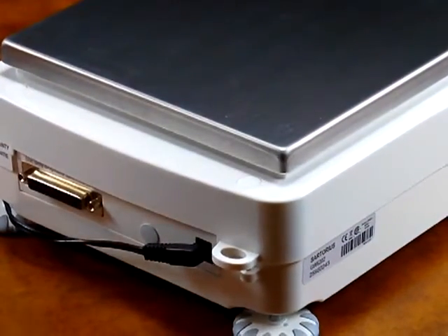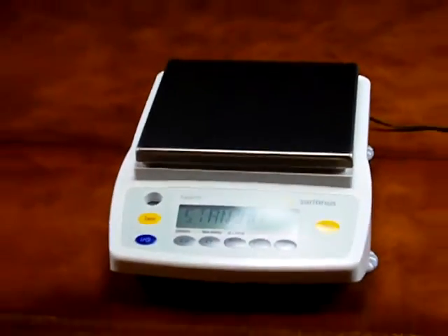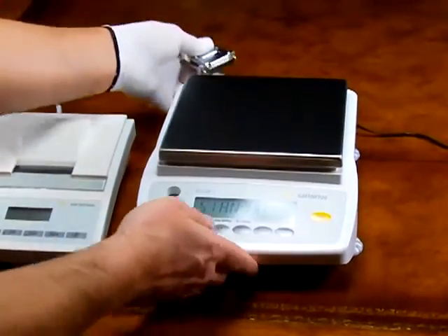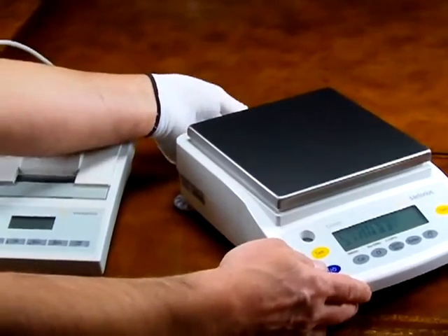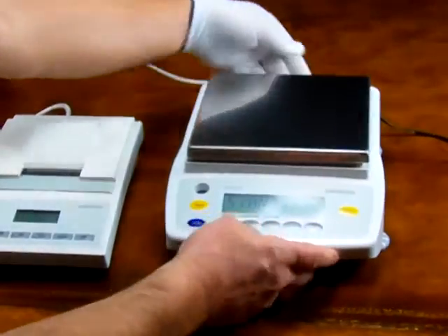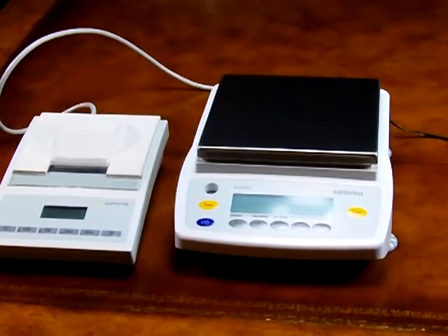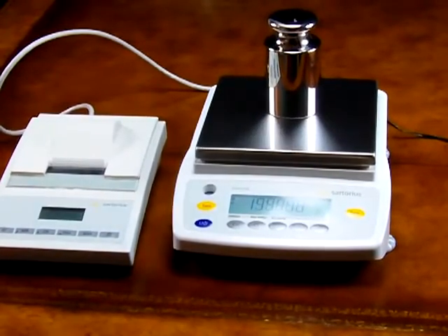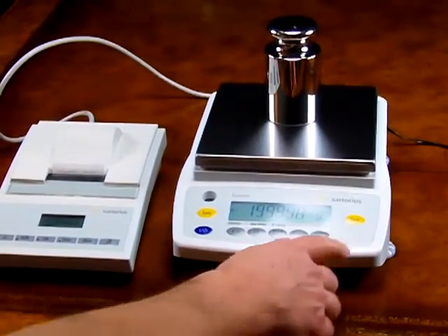The balance also features an RS-232 interface where you can connect it to a computer using WinWord software or a Sartorius printer. We have a printer here today to give you an example of how simple it is. Simply plug the balance into the printer via the RS-232 cable, turn the balance on, hit the print key, and it records the weight.